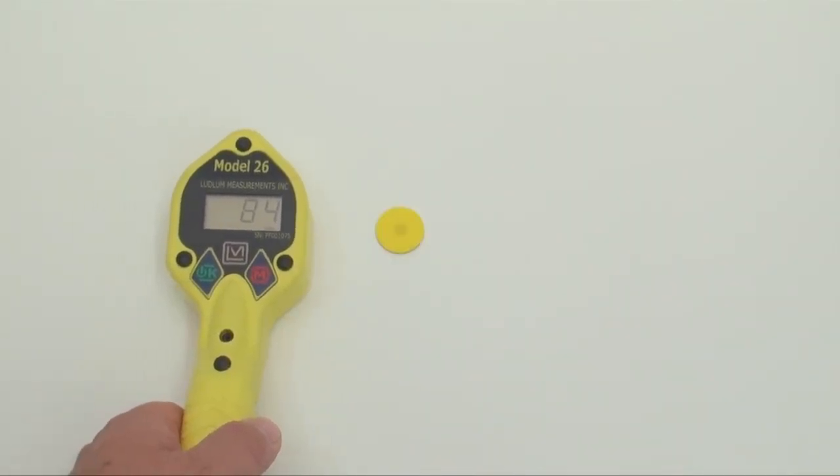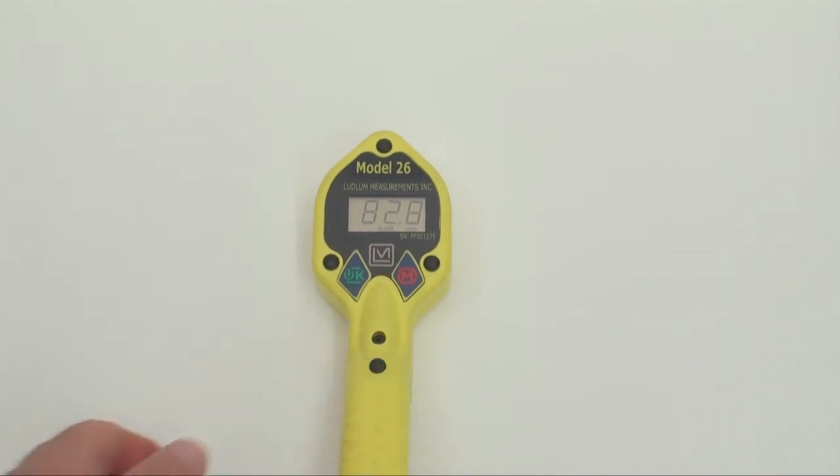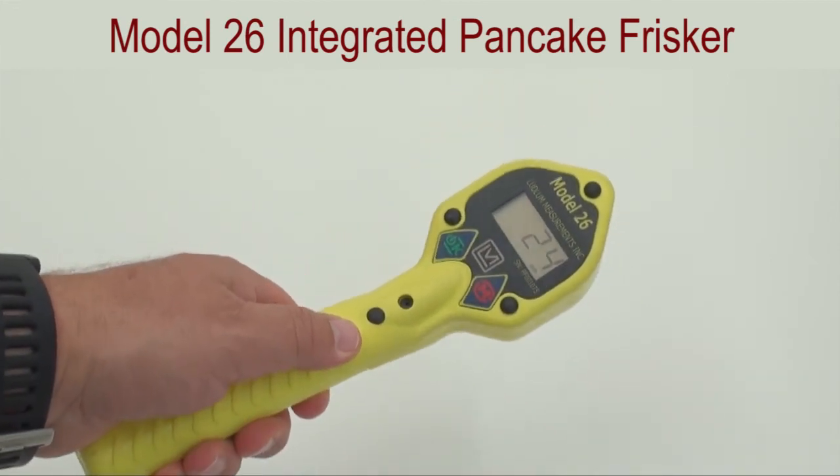Ludlum's Model 26 is a great multi-purpose radiation contamination detection instrument for those looking for a low-cost, simple instrument that just looks and feels right.